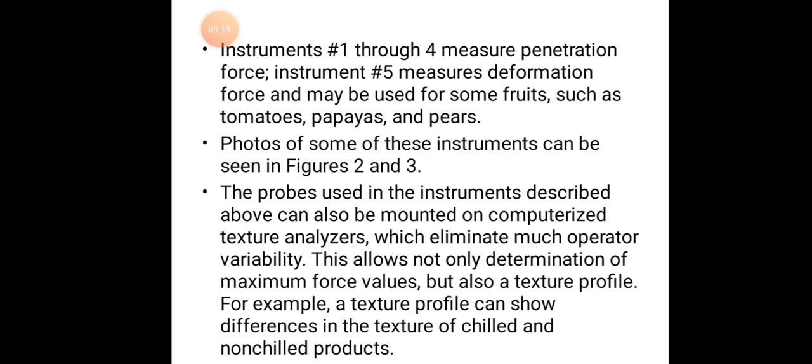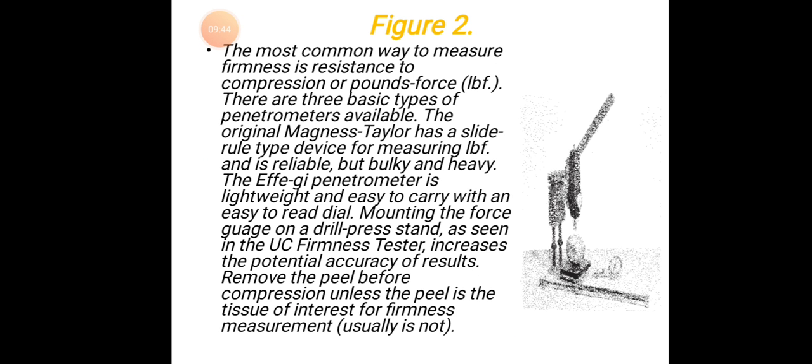The probes used in the instruments described above can also be mounted on computerized texture analyzers, which eliminates much operator variability. This allows not only determination of maximum force values but also a texture profile. For example, a texture profile can also show differences in the texture of chilled and non-chilled products. Figure 2. The most common way to measure firmness is resistance to compression or pounds force, that is LBF.